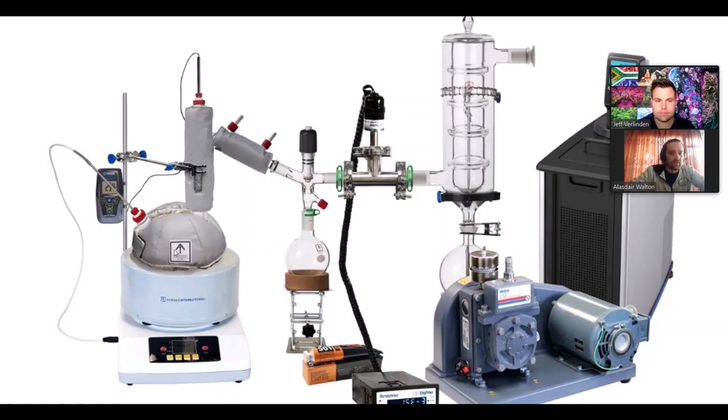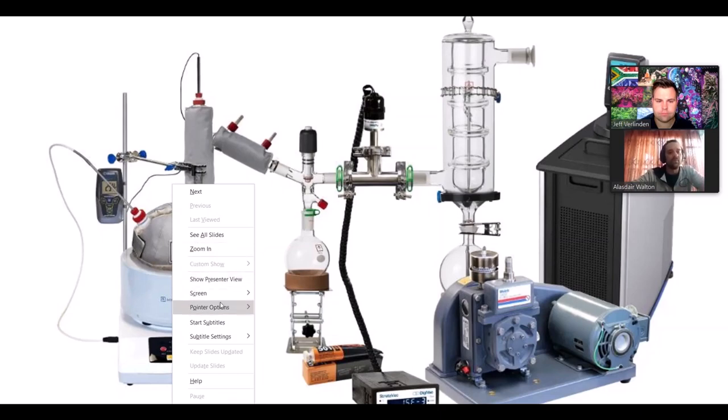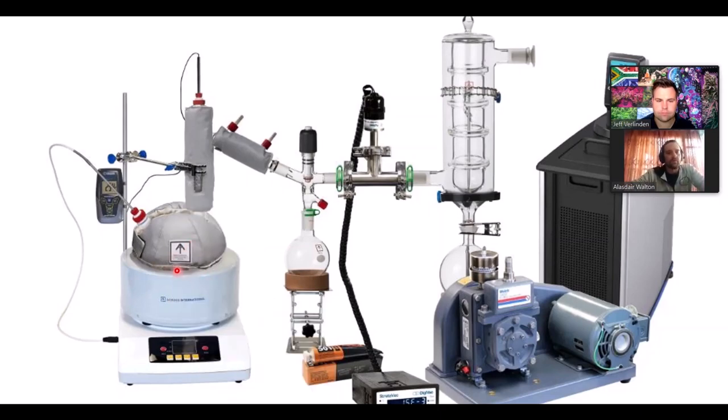Yeah, so here we're looking at an Across International short path distillation kit. I do think they're available locally through Amazon, I believe. Very good quality products, American brand. What we will start by doing is firstly, obviously, extracting our oil, cleaning up our oil as much as we want, and then loading it into the boiling flask, which is what you're pointing at now. Once it's in that boiling flask, we will try and pull a vacuum on it until we get to the deepest possible vacuum we can get to. While there's no heat, there's nothing happening. All you have is oil sitting in that boiling flask. You generate a vacuum, which you can see is by the Welch pump down there on the right, and then you monitor that.